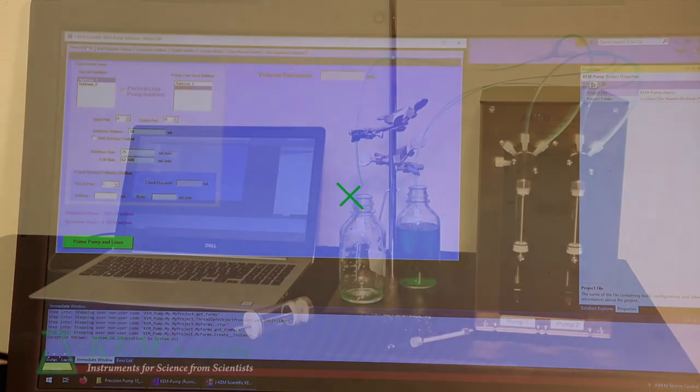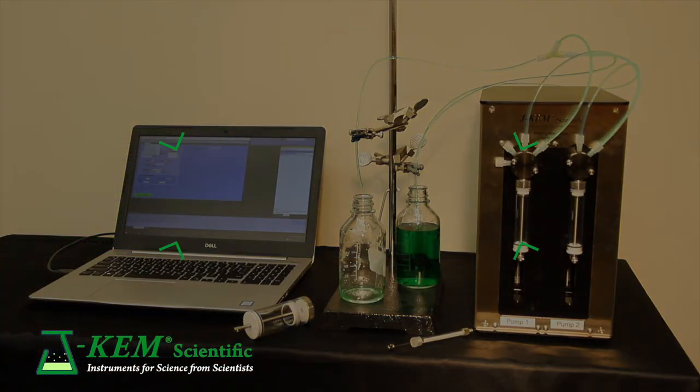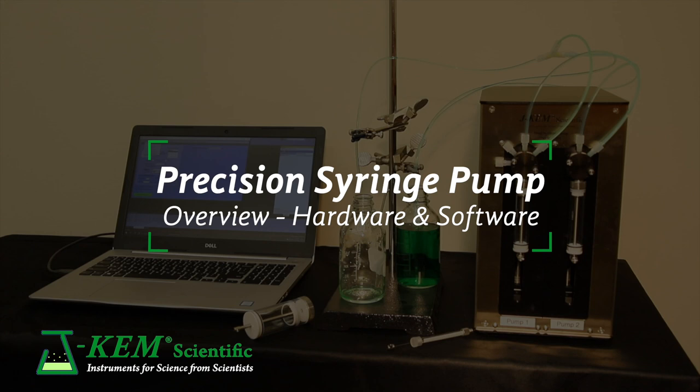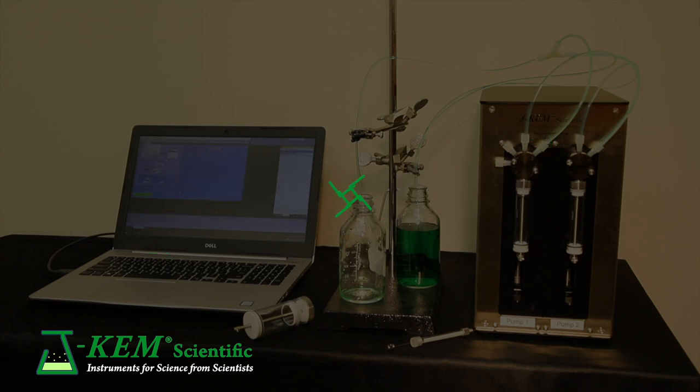And so, that is J-KEM's Precision Syringe Pump. It's software that comes with it at no charge. J-KEM offers, remember, the option of one custom program at no charge. Thank you for your time.